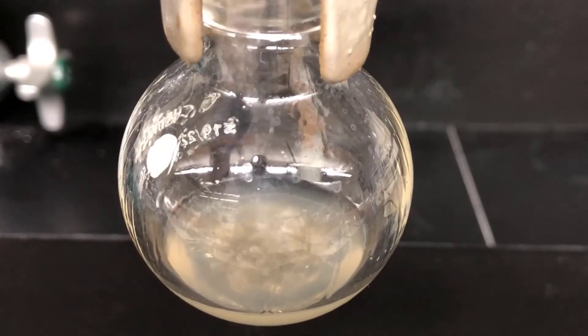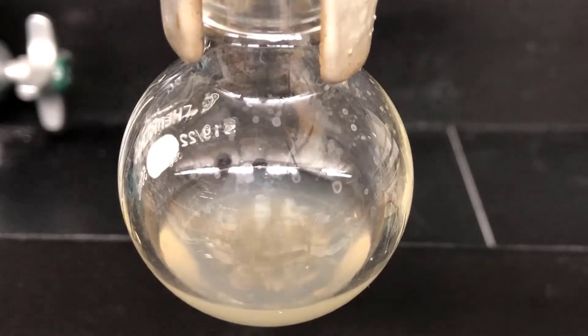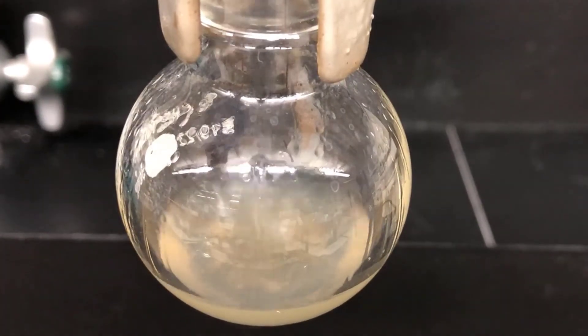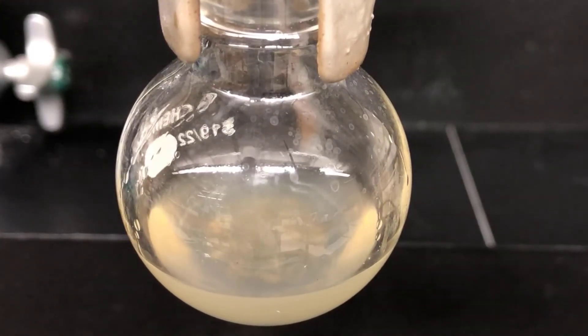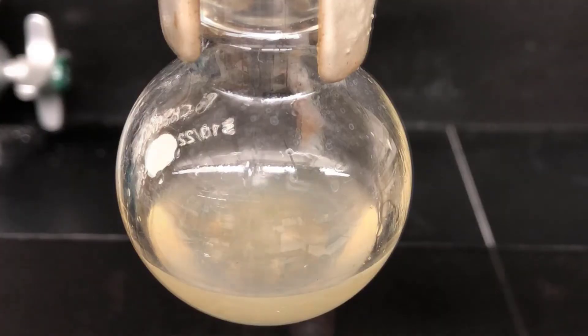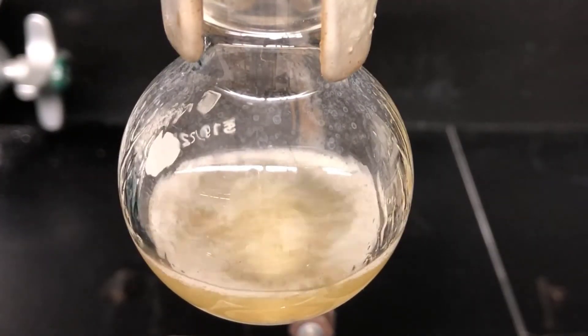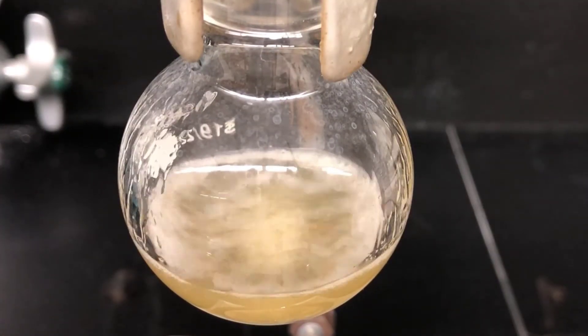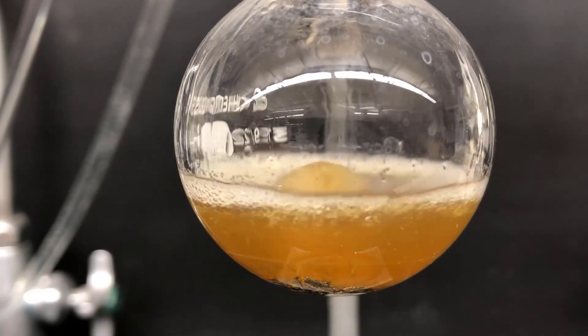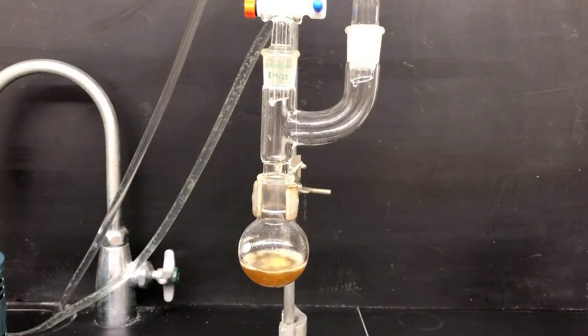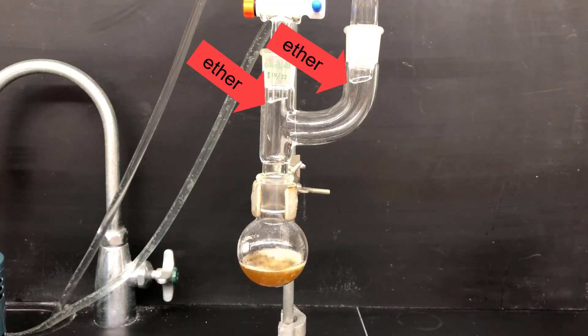Now that the initiation reaction has started, I'll add the rest of the bromobenzene and ether solution from the addition funnel in a couple of portions. The bubbling may slow down temporarily, but it'll pick back up again. And you'll end up with a rolling boil like this where you see more of the yellow and brown color developing. Here's a side view of the reaction boiling under its own heat. And here you can see ether condensing and dripping back into the vessel.